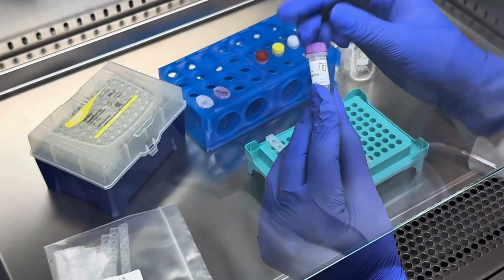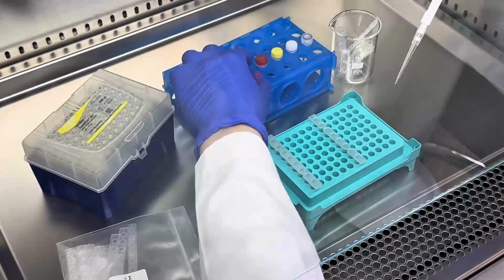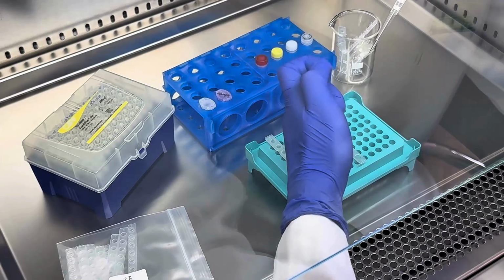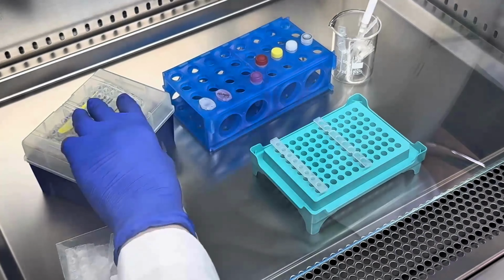For the standard curve, pipette each of the quantification standards A, B, C, and D in at least 2 copies, again in a volume of 25 microliters. Seal the vessels with the caps.